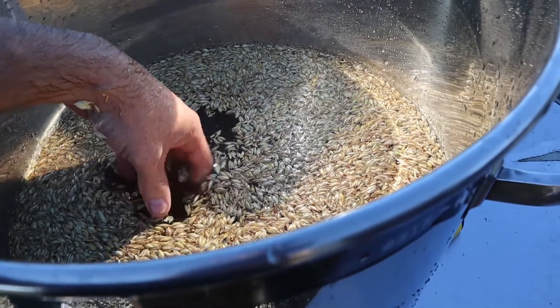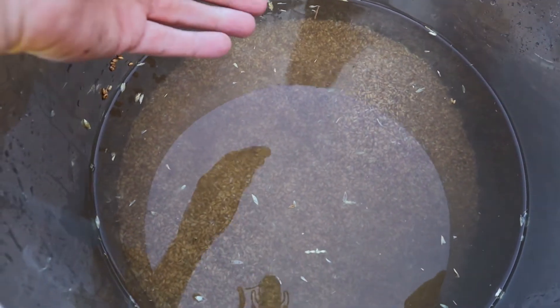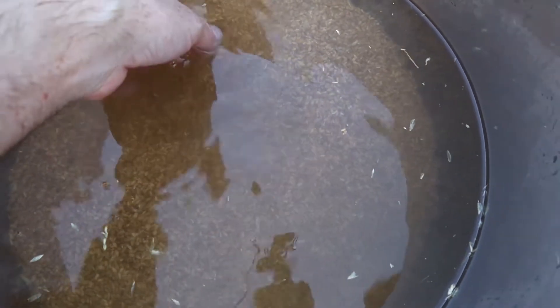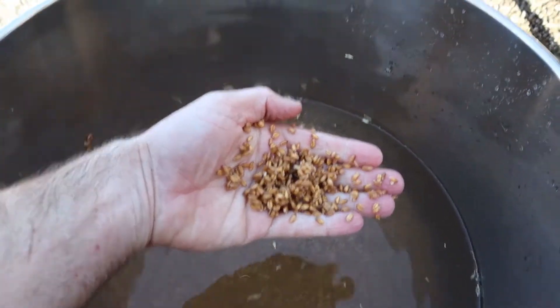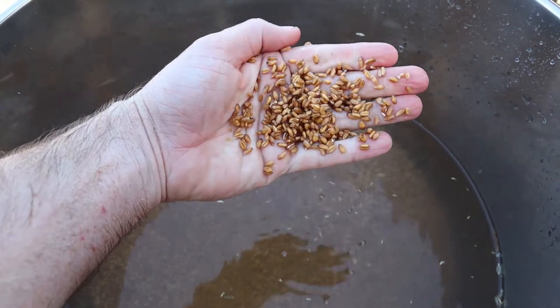I like to clean my grain really well, and that means I can cut the sterilization time down a bit further. There we have clean grain — it's not perfectly clean but you can see through it. From here we will completely drain it off, then bag up the wet grain, mix in a certain amount of water with the wheat grain, and then straight into the sterilizer.